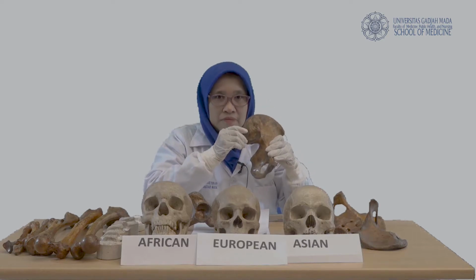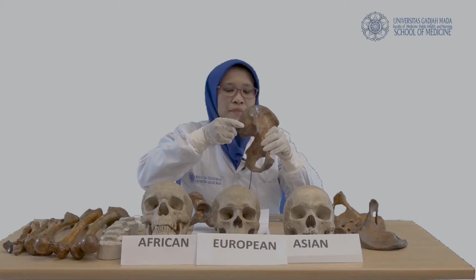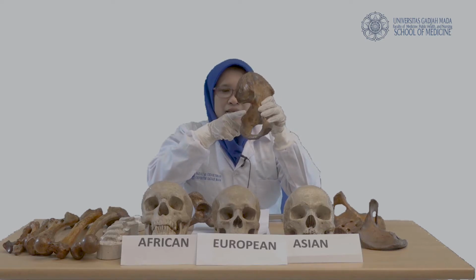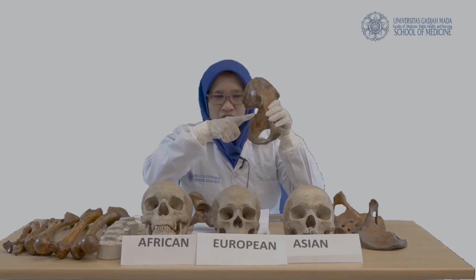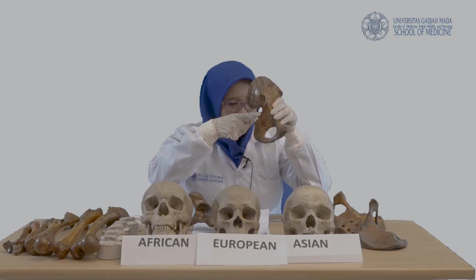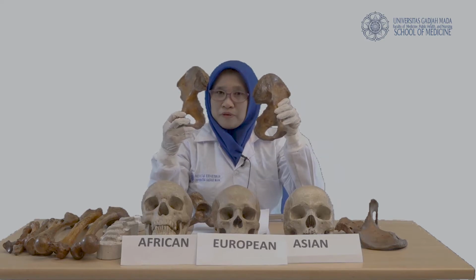Some parts of these pelvic bones can be differentiated between males and females, such as this one. This is the greater sciatic notch. The greater sciatic notch of the male pelvic bone is deep and narrow compared to the female one. This belongs to the female, on my right hand.